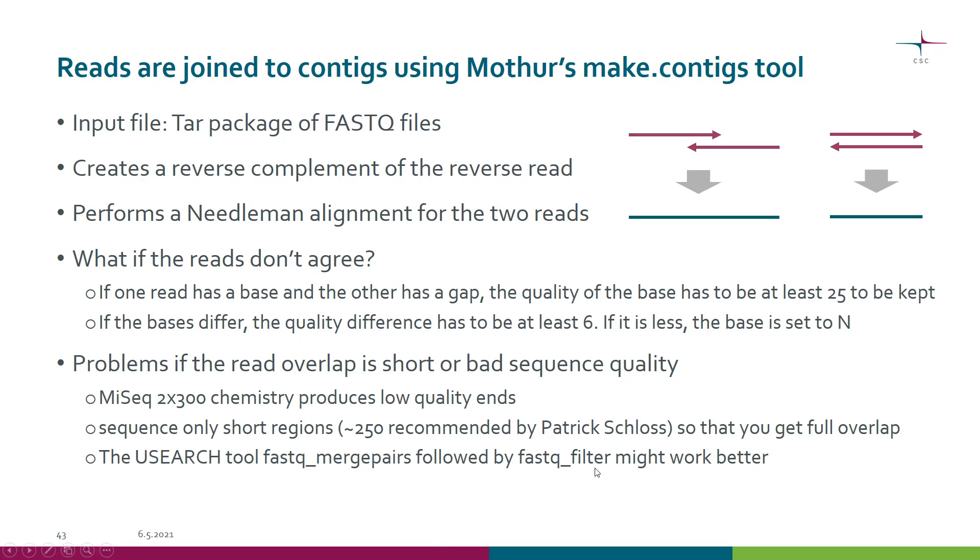Because of licensing reasons, we are not able to integrate USEARCH in Chipster unfortunately.